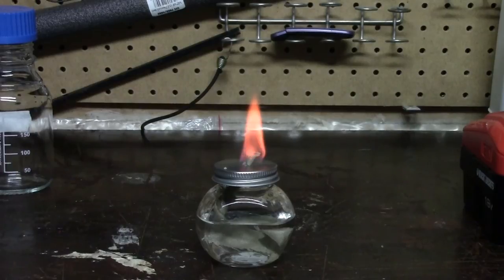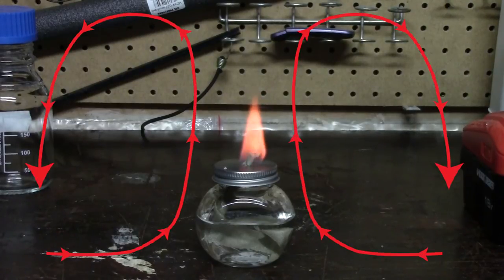The other thing it does is it creates some air currents which help us to keep things clean. Basically, the heat of the fire causes the air near the lamp to rise. This draws in air along the bench. It then goes vertical into a column and it spills out around the edges.